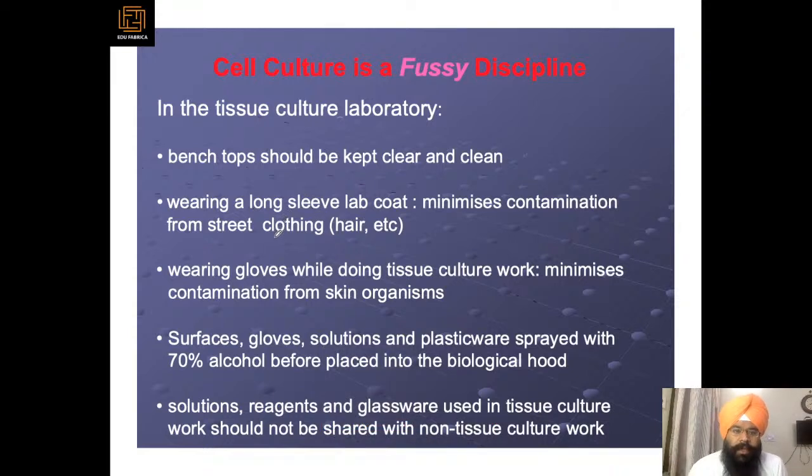In a tissue culture laboratory, the bench top should be kept clean and clear. As we discussed yesterday, wear long sleeve lab coats so that you have minimum contamination from your clothes or hair. Always wear gloves so that skin organisms do not come into your cell culture. Surfaces, gloves, solutions, and plasticware should be sprayed with 70% alcohol before being placed into the biological hood. Solutions, reagents, and glassware used in tissue culture work should not be shared with non-tissue culture work.